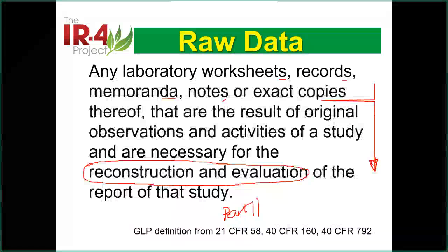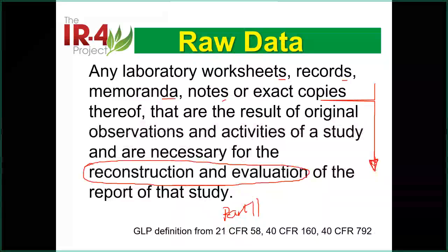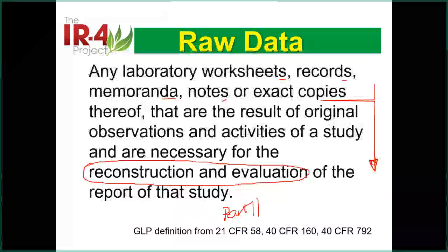So what we talk about now, another thing is on my computer, on my end, I take a piece of paper, I do the work, and that's no problem. This is the record. We can tell. But when this becomes electronic data on your end, how can you validate that your data and this original data are the same thing?